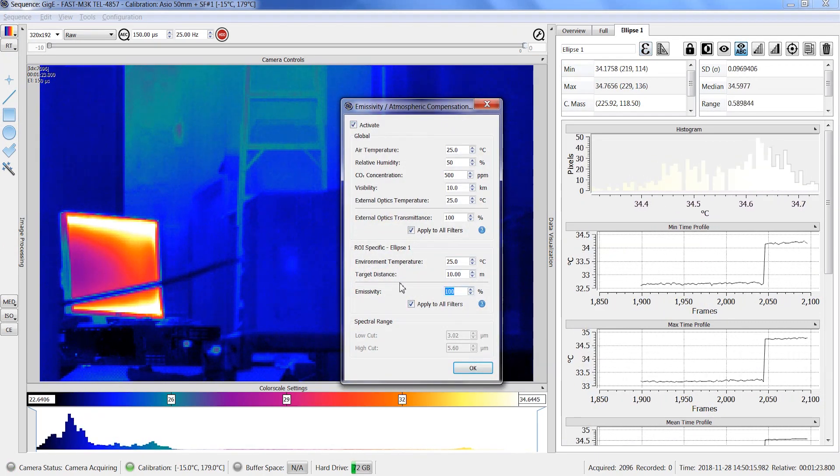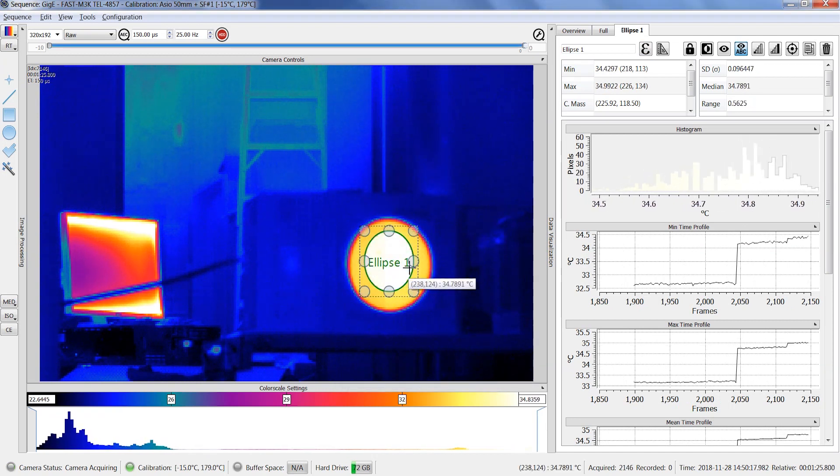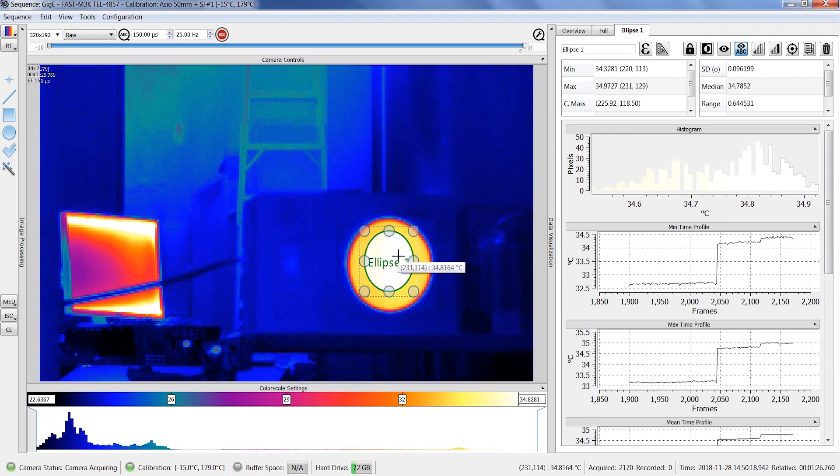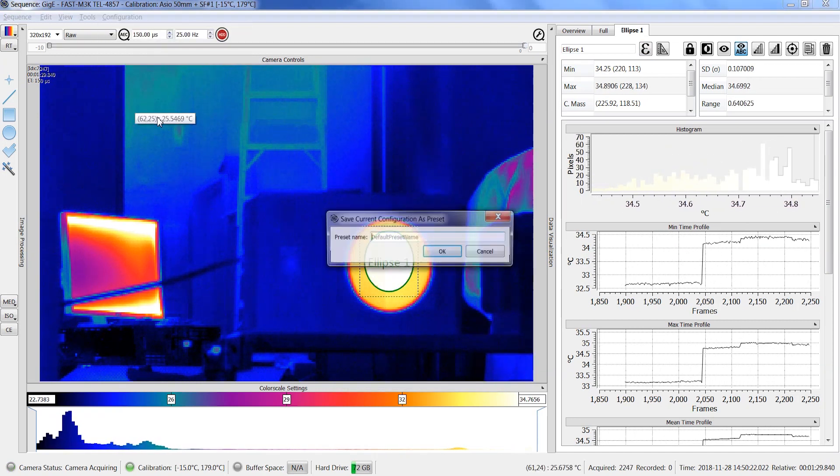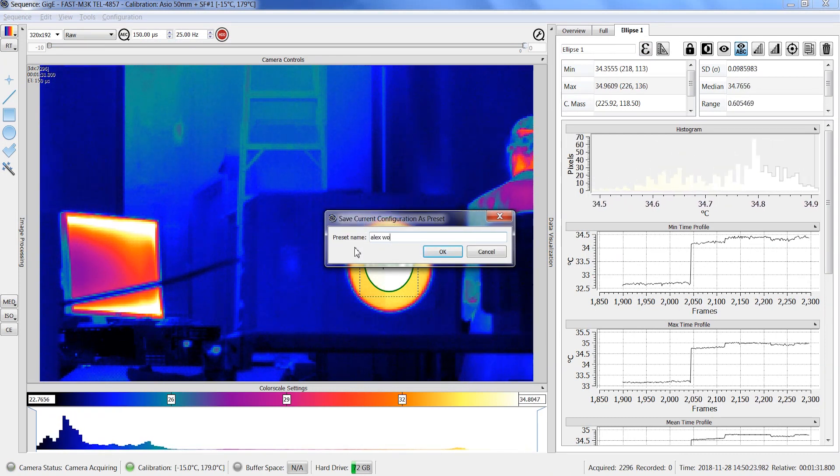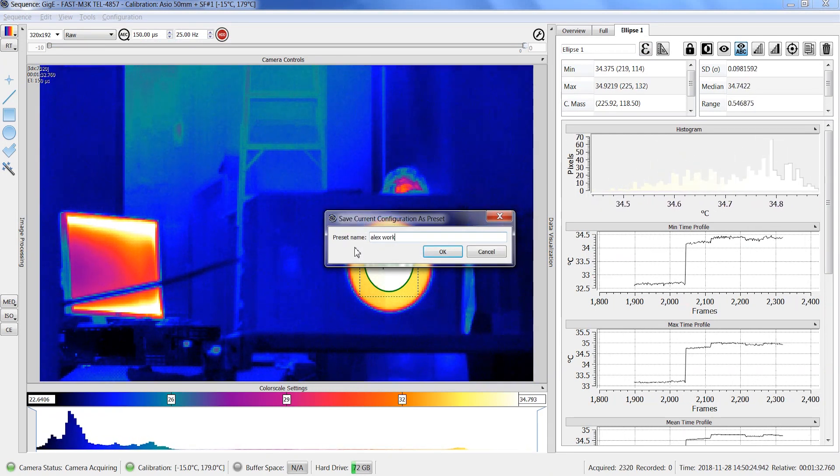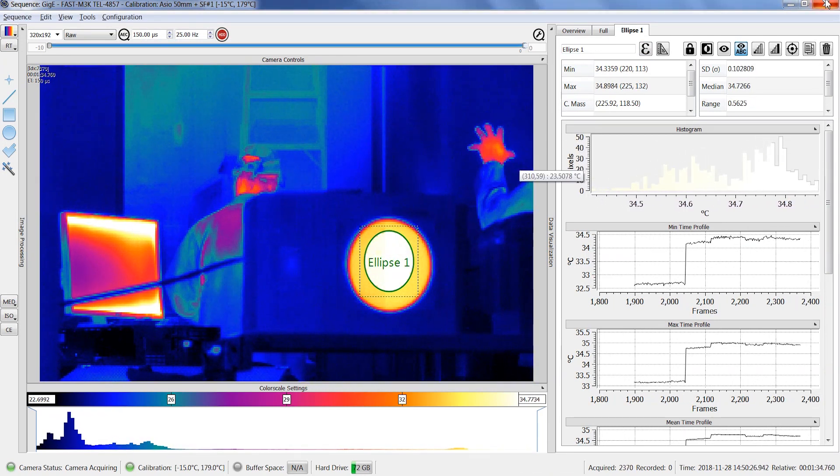All major configuration parameters that we've just demonstrated can be saved as a preset for your next acquisition. Once you start a new acquisition from the main window, it is possible to use the saved workspace as a preset selection or use the last camera configuration.